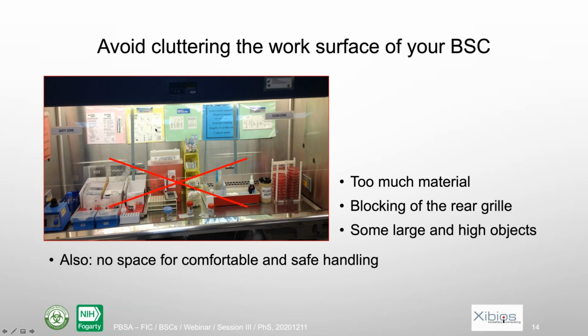Also, there are some high pieces of equipment or materials. That means that the airflow will be disturbed. You have turbulent air, so you will lose personal protection. And of course, you cannot imagine that someone could work in a comfortable, safe way in such a mess. So this is something that you should definitely avoid. First, a biosafety cabinet should not be used for storage, and then even when using it, you should avoid anything that looks like this. You should just have the materials you need for your work and nothing more.